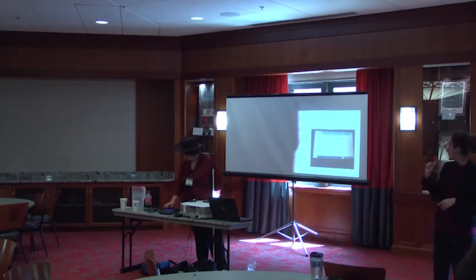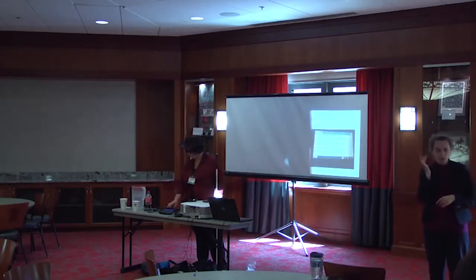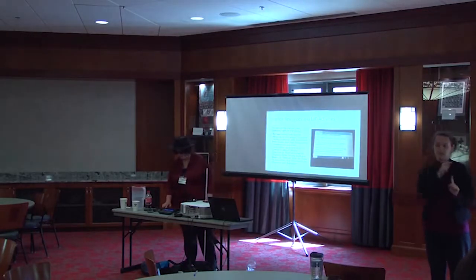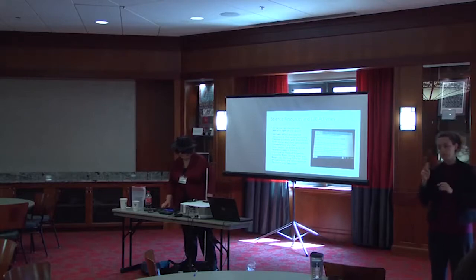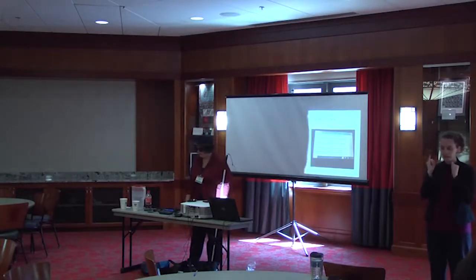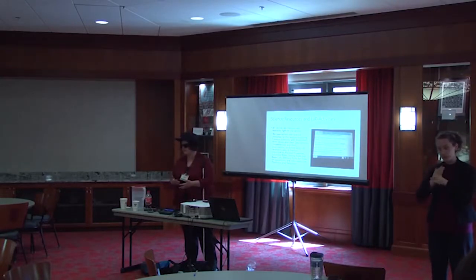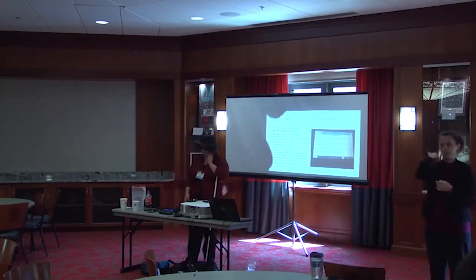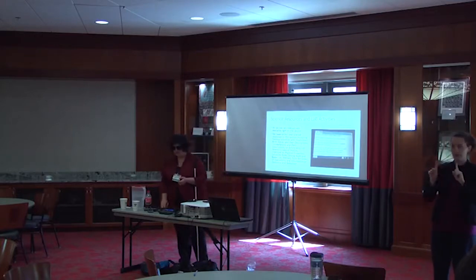LabQuest application, graph page, plot details box, run 1 temperature. I believe this is a page that says embossing, is that correct? Correct. Okay, well, I already told you about that. Embossing is the fancy way to say raised line drawing, so you can work with raised line drawing on that. We do have a 4-function calculator on there. Is anyone interested in seeing the calculator? It's a calculator. I assume you guys know how to add, subtract.